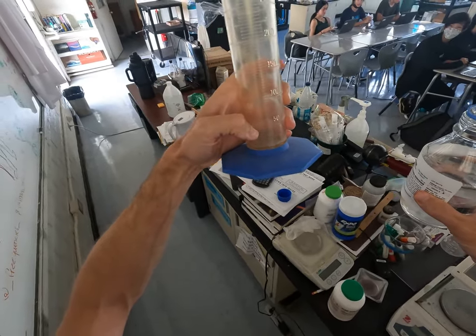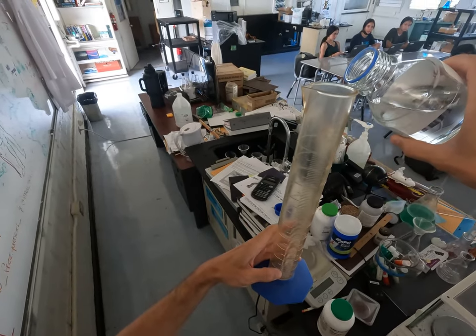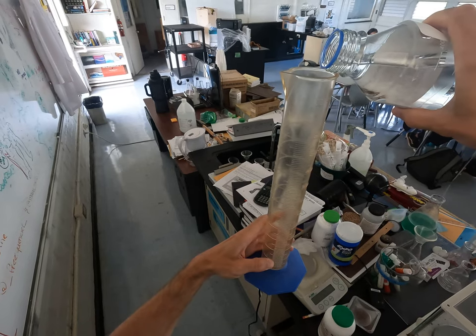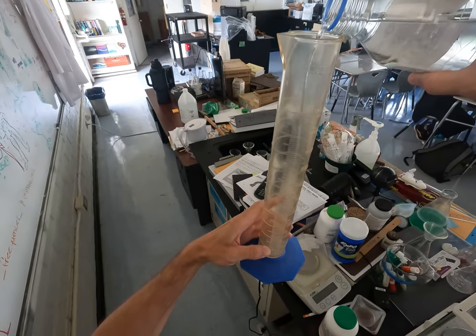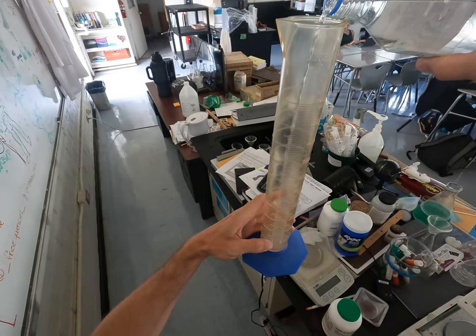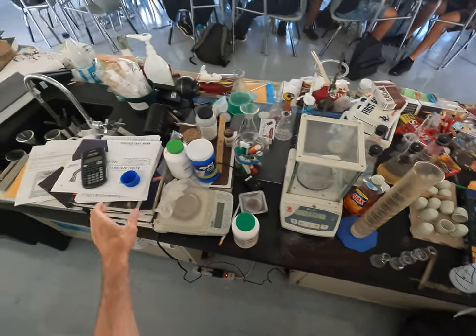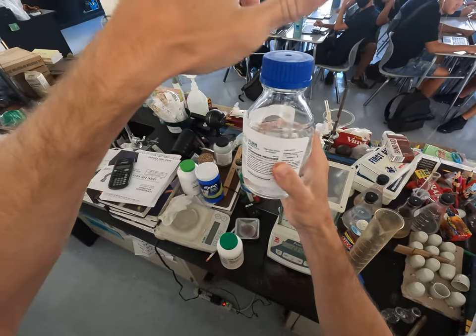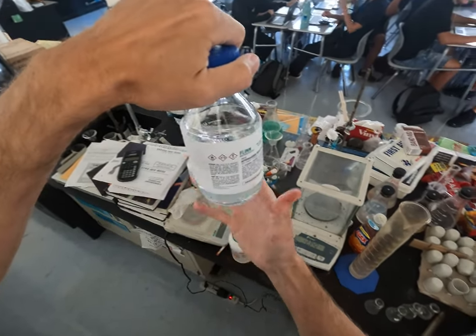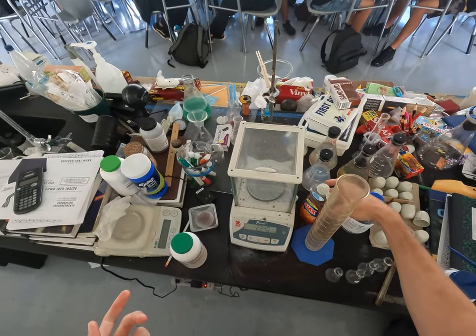This is not a super accurate measuring device, so it's not going to be super accurate, but that's about 40-ish, maybe 50 milliliters of 30% hydrogen peroxide. And this is my first time doing this — I found this bottle under a sink in L building. I don't even know if it's actually hydrogen peroxide anymore.